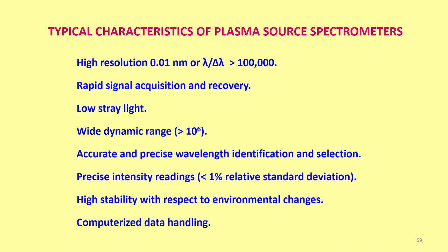So, rapid signal acquisition and recovery is another advantage. Stray light almost nil, because the plasma is transparent. Wide dynamic range, this I have already explained to you.